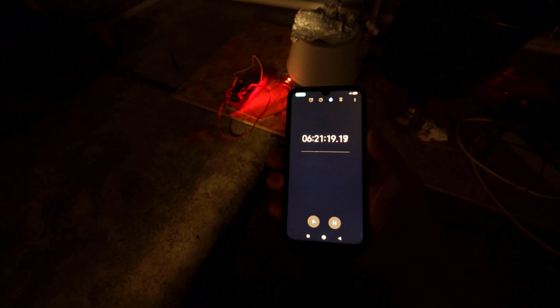Alright, it almost had 6.5 hours. I'm going to stop this now and return to this tomorrow, cover this up a little bit, but let's turn it off.